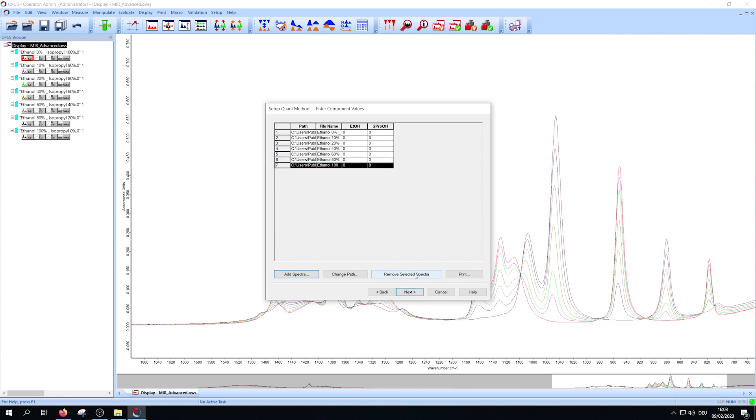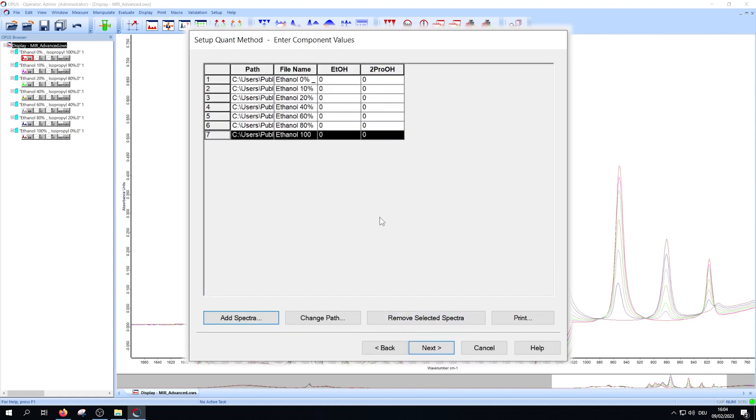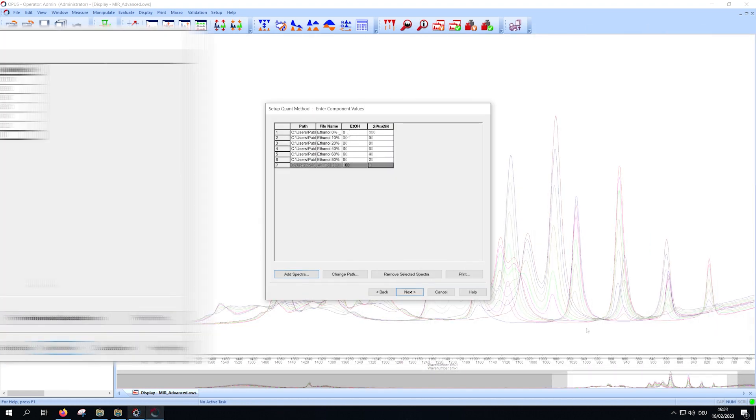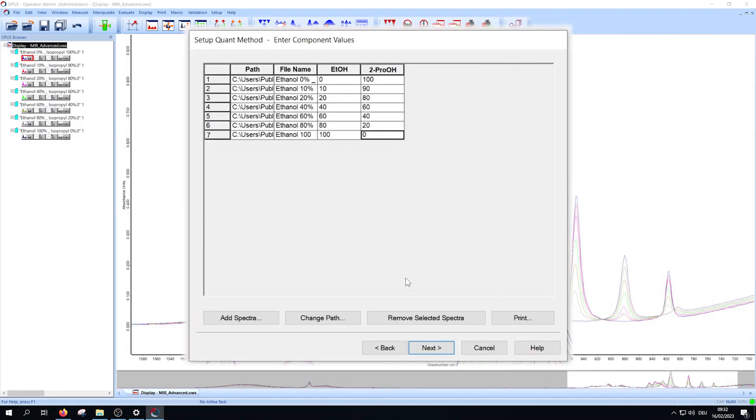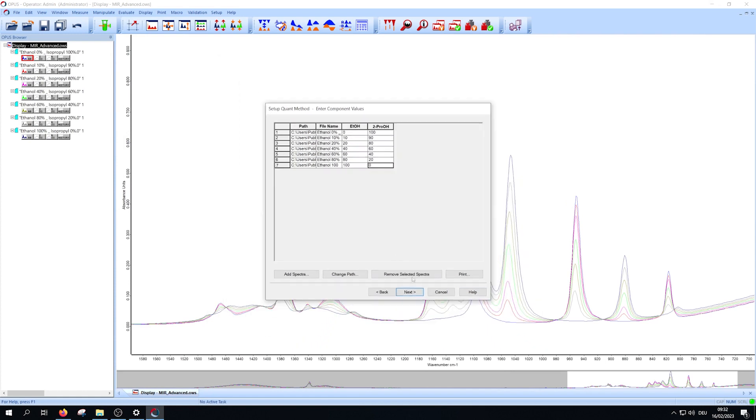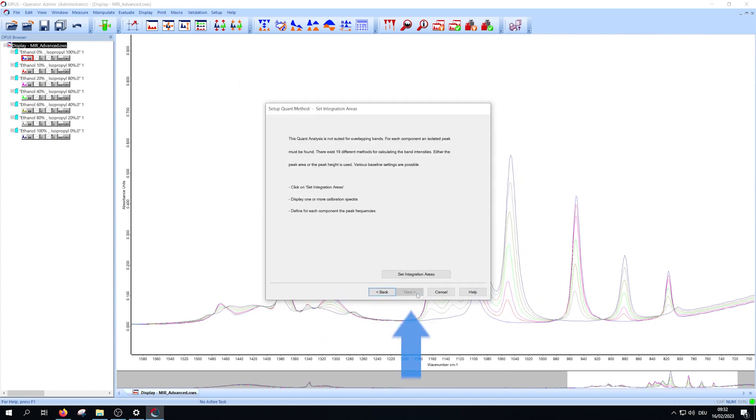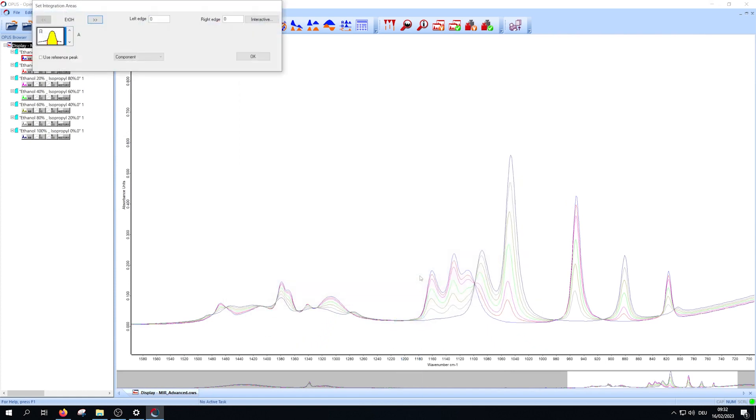Now you must define the concentration of every component in your opened spectra. Enter the values of the components in your pre-selected unit. For the following step press next and then press set integration areas.